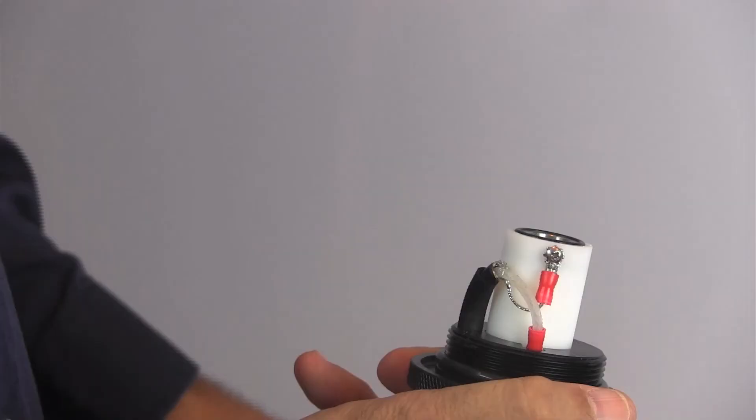Note the wire orientation. The thicker insulated wire should be at the bottom, and the bare wire connected to the electrode at the top.